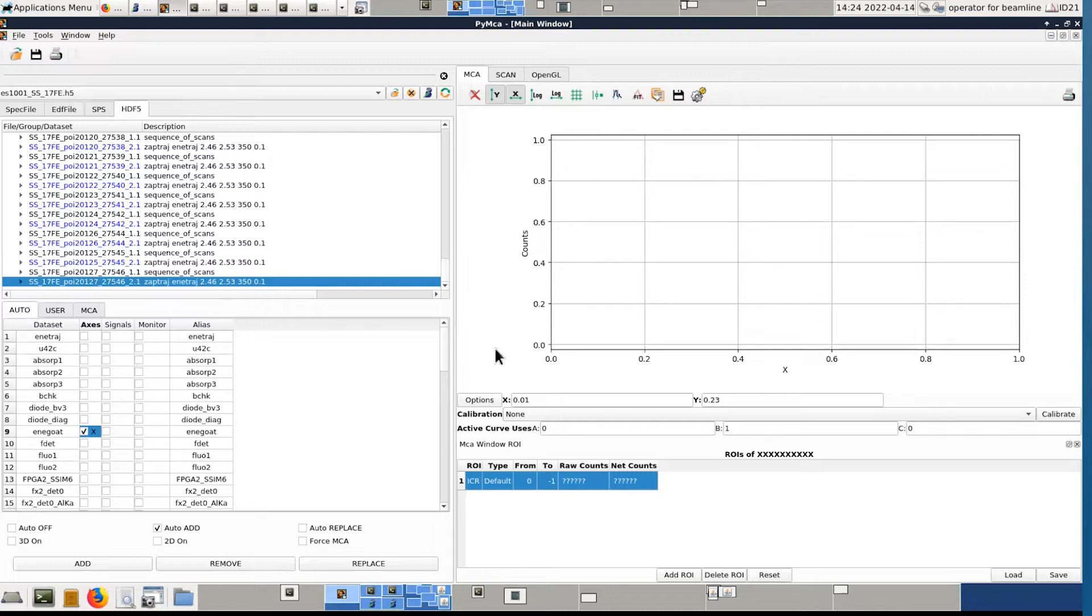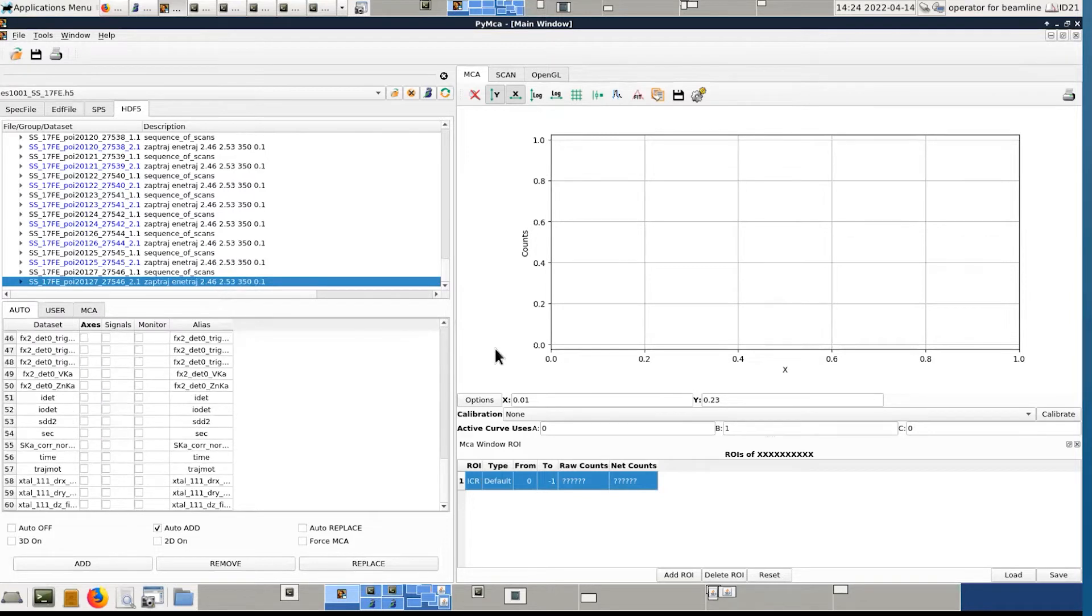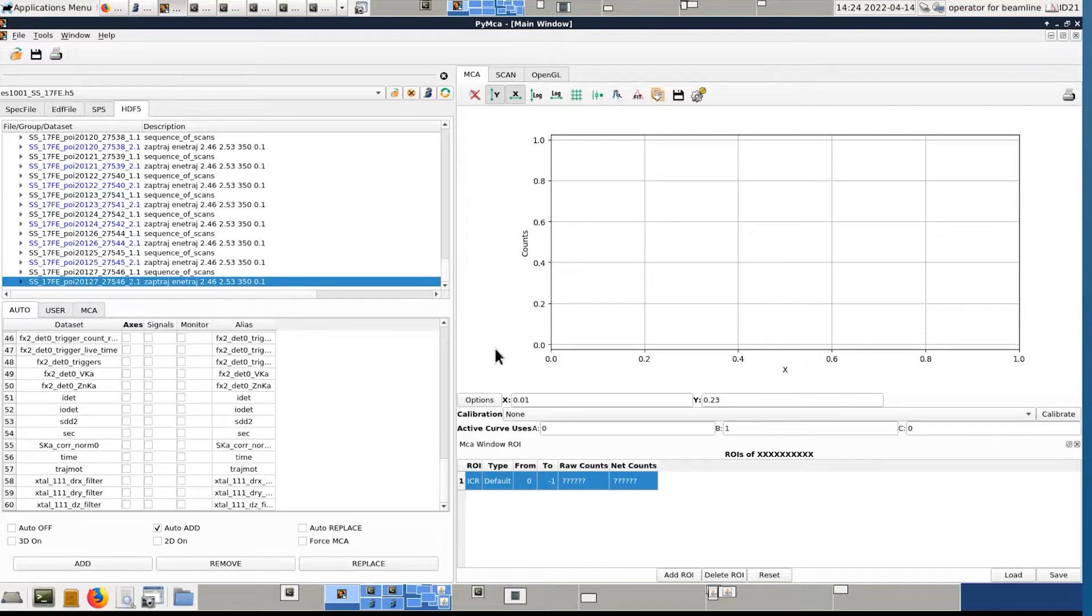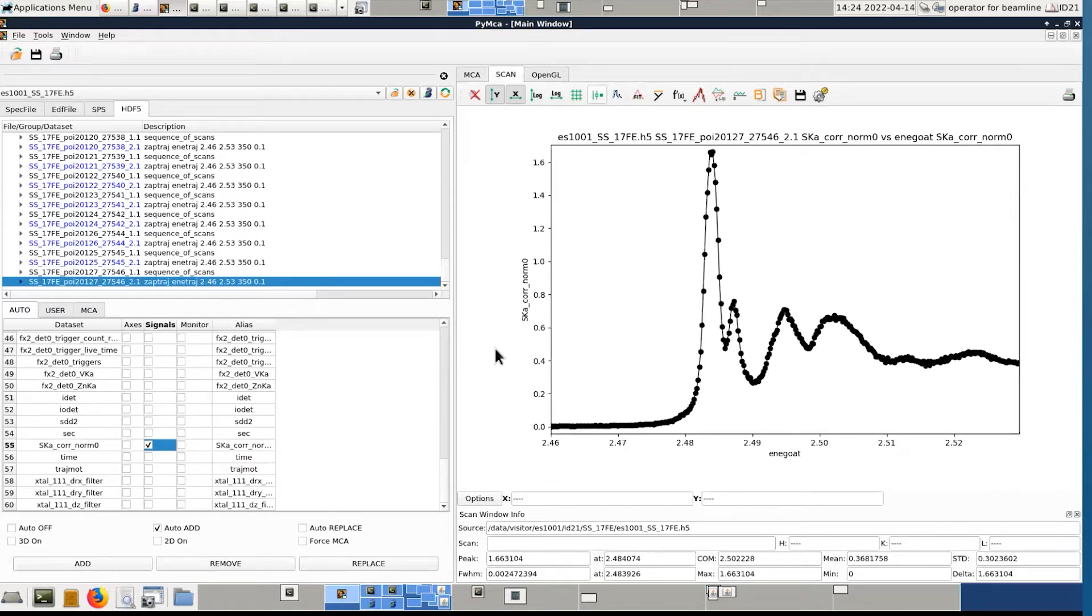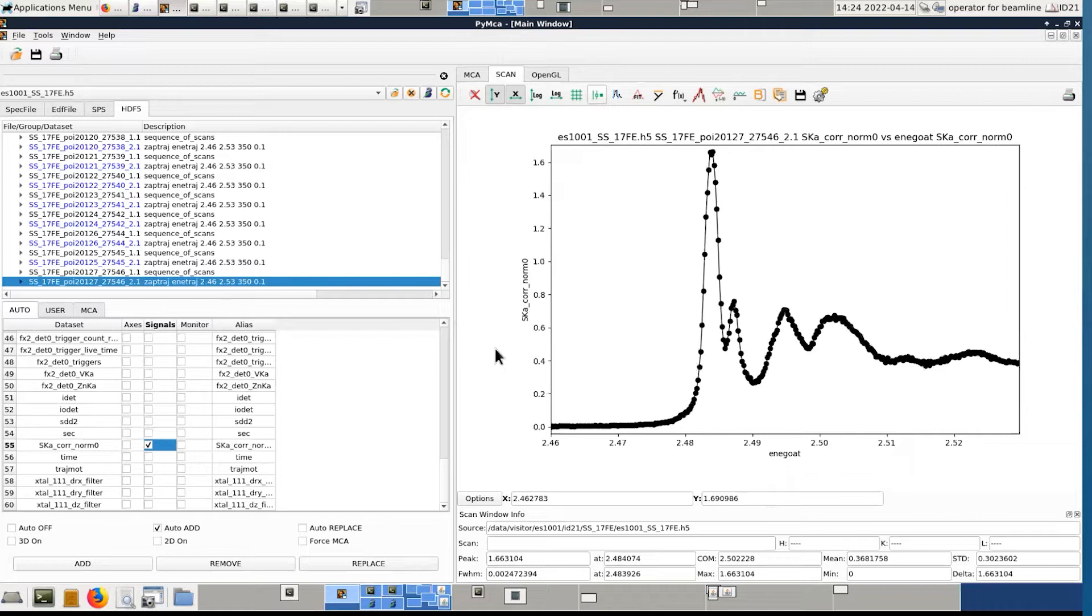And in your case, the y-axis of interest is the signal from sulfur, which is named sulfur k-alpha, corrected by the dead time and normalized. So if I do that, now you see a spectrum acquired on this particular point, which the display you can change with this symbol. So either only lines, lines and dots, or only dots in principle.